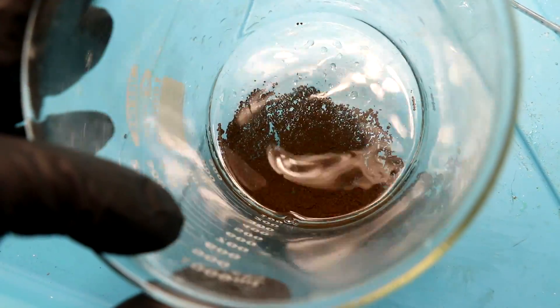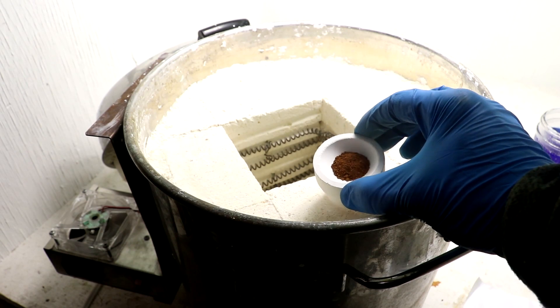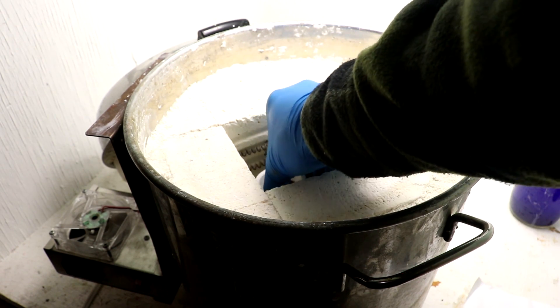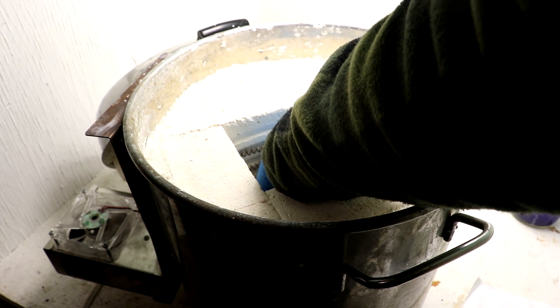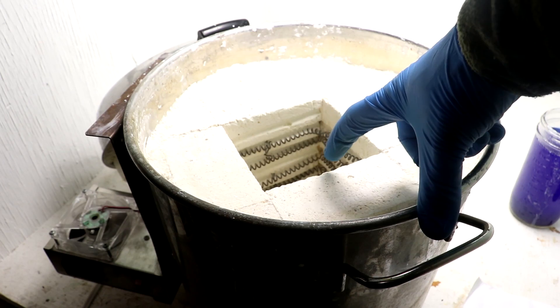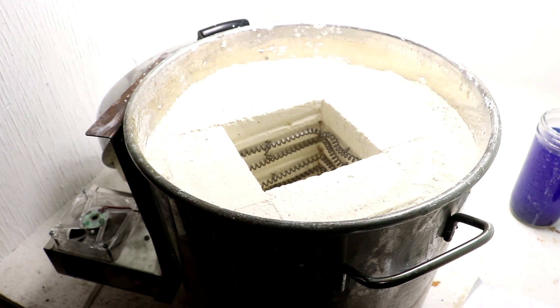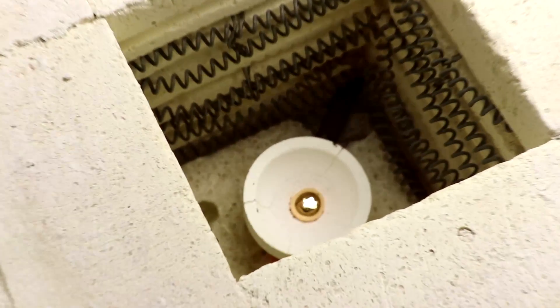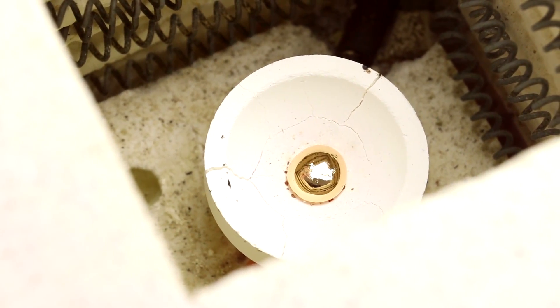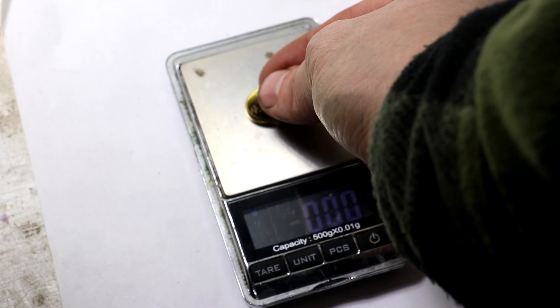Here it is after I've rinsed out all of this green solution — we've got some pure gold powder. I've transferred the gold powder into a melting dish and now I'm going to put it inside my furnace, which I have rebuilt. You can see it now has much more insulation and a new element. And here we are — the gold has melted into a bead. Very nice — I've cooled it down now.